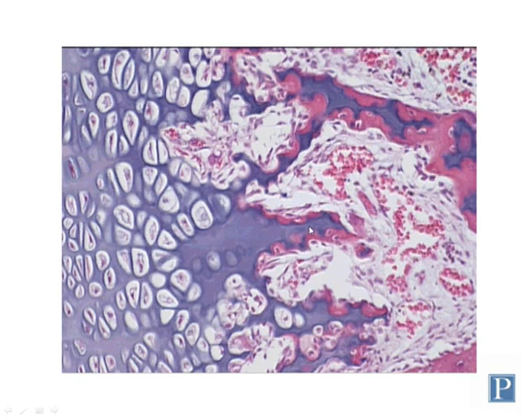And then finally, you have the final zone of development, which is called the zone of ossification and resorption. You can see where the matrix starts turning its mature eosinophilic color, which is typical for bony matrix. Here you have osteoid and other substances that change the chemistry of the matrix, making it more eosinophilic in appearance. You can also see that the matrix here thins out.